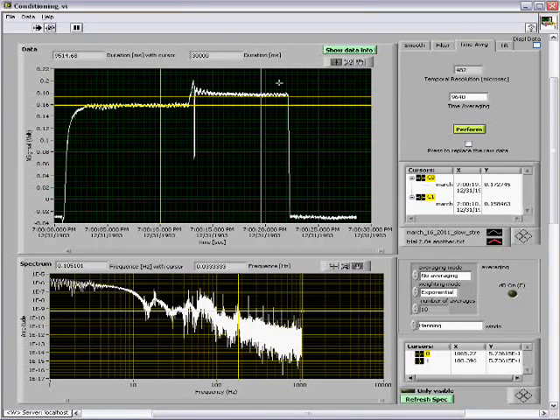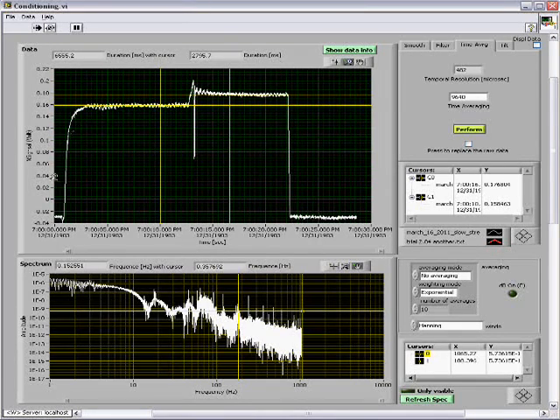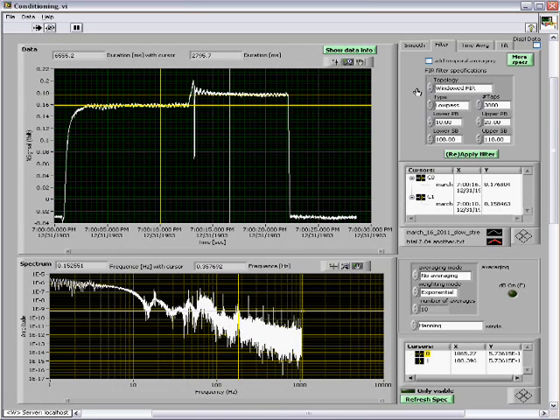Normally, this conditioned data goes to the analysis module in order to calculate the rise time of the force and other things. You can always use these tools here to inspect your data, but there is not much else to do here other than filtering. Filtering is a much more complex process, and it can add more features to your curve. For example, it can change the rise time if you don't apply the right filtering. So I don't recommend doing a filter on your data before you analyze it.